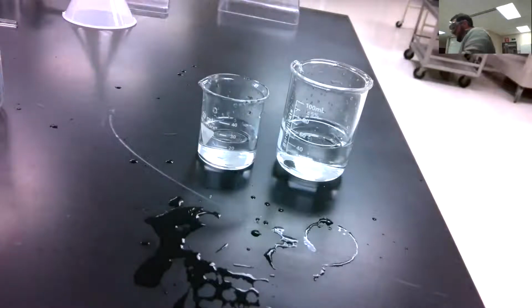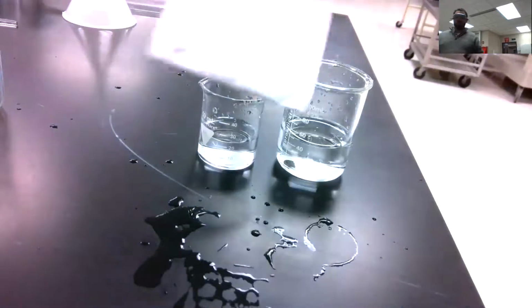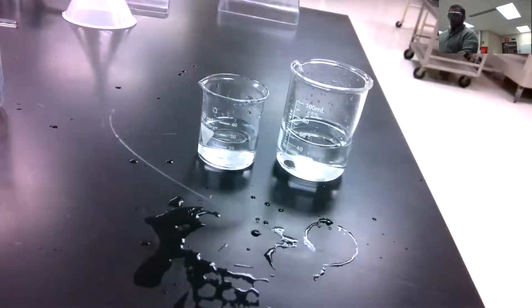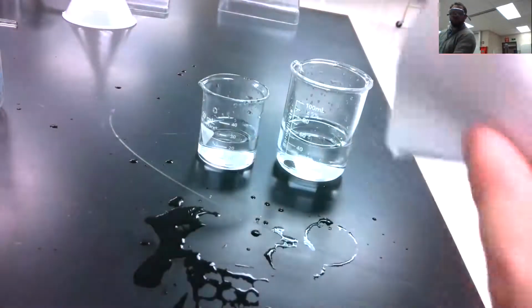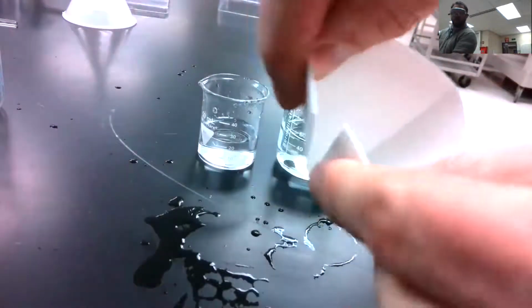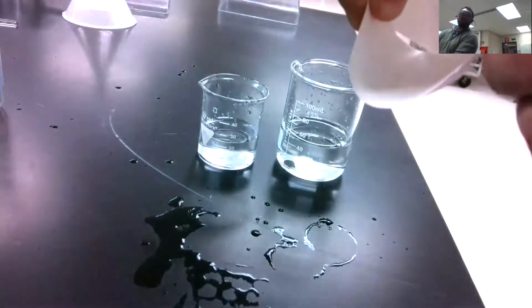So the idea here is we've got our filter paper, we folded it up. You guys watched me do that. We folded it up into almost like a pizza shape here. Well, we only want to open up 1/4 of it. We want to make sure that when we open it up, just opening up 1/4, there's no hole in there. So a lot of people open it up like this and say, oh, look at that. But you guys can see there's a hole in the bottom.